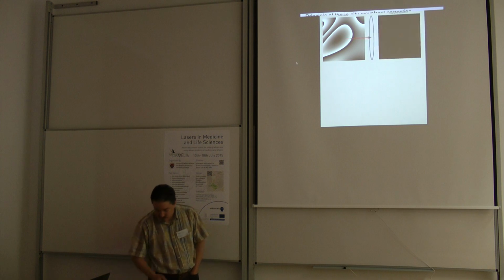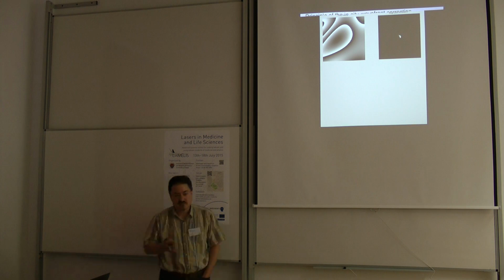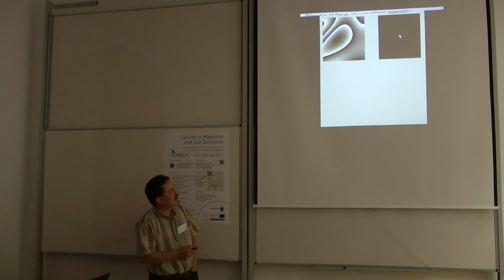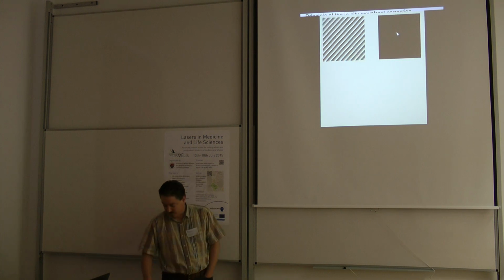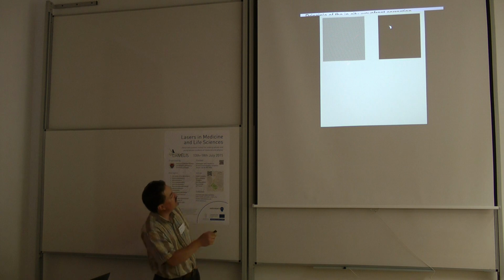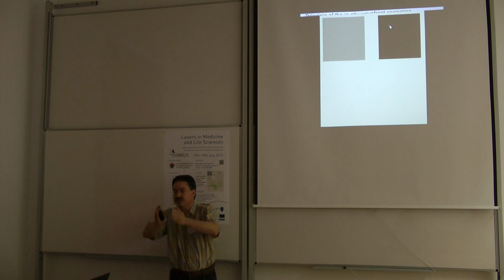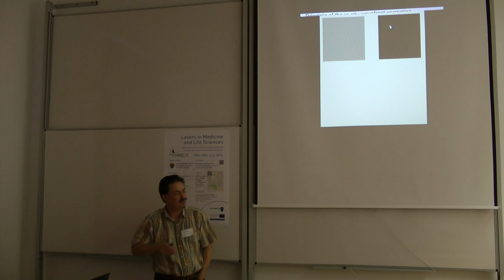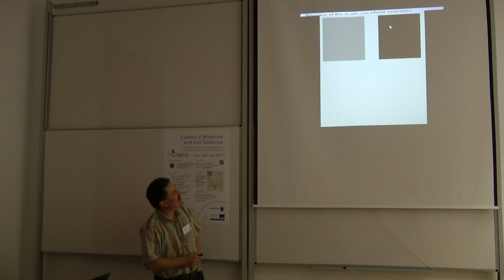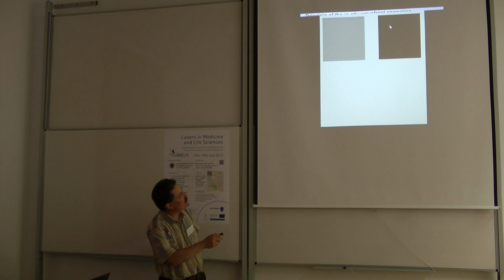What I see is what happens when I send this through the lens. So here is my aberrated beam, right? And I want to create a very nice one. So what I do, I apply a grating on it first. Again, you can see these 2 pi jumps in here because it's like a tilted wavefront, but I just cut it into these 2 pi segments, so I have this modulation in there, right?